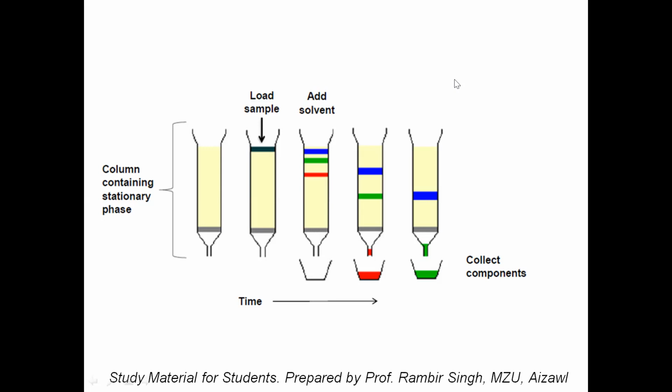Now, if I add some organic solvent in water, then its polarity will increase or decrease? Its polarity will decrease. Very good. When its polarity decreases, its interaction with the C18 column will increase or decrease? Its interaction will increase.